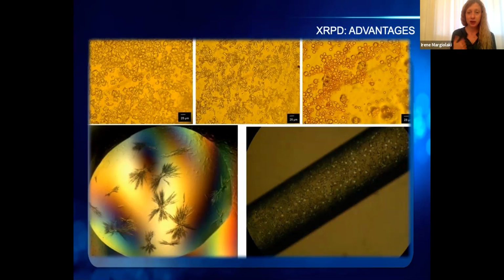It's critical for the development of pharmaceuticals, but it's also critical for performing a successful X-ray free electron laser experiment. So usually what we currently do is powder diffraction prior to X-ray measurements in order to verify that our sample consists of one polymorph and the crystals have the right dimensions and morphologies to ensure higher chances of a successful experiment at XFEL.